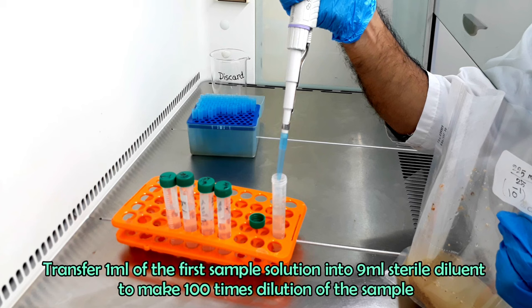While counting 10 inverse 6 dilution plates, we found 85 colonies in trial 1 and 78 colonies in trial 2 plate, which are acceptable count, because the counts fall between 25 to 250 CFU per plate. Let's learn how to calculate bacterial colonies for the original sample. We will follow the formula 1 when the colony count of all plates from two successive dilutions falls between 25 to 250 CFU.